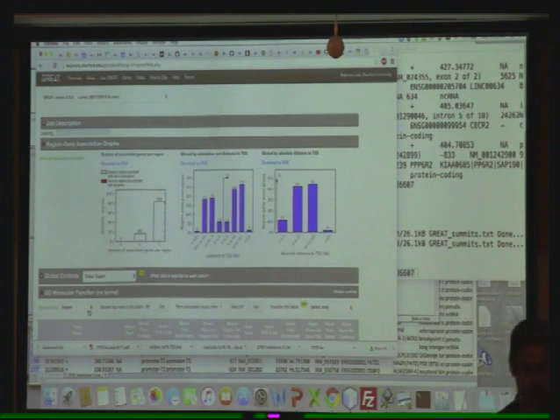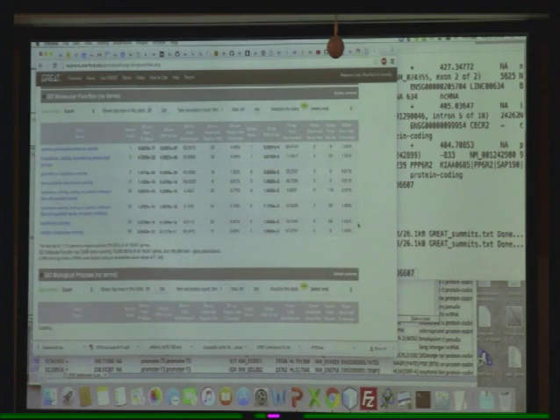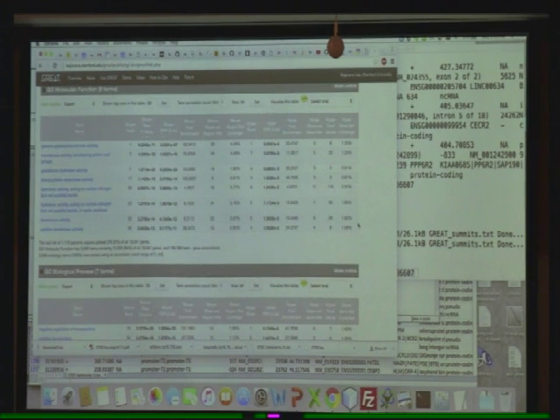Okay. So in your Great Summit file, can you just quickly recap, where did you find that Great Summit? So that actually comes after you run MACS, you get a chromosome file that tells you where all your peaks are. So it says your chromosome, your start and your stop. It's just those three columns. So you can open up that summits.bed file from MACS, delete the last two columns, and then you get this Great Summits file, because Great actually has a problem if you have extra columns in it. So you just want the chromosome, the start base pair, end base pair, and then upload that file, 3 columns.